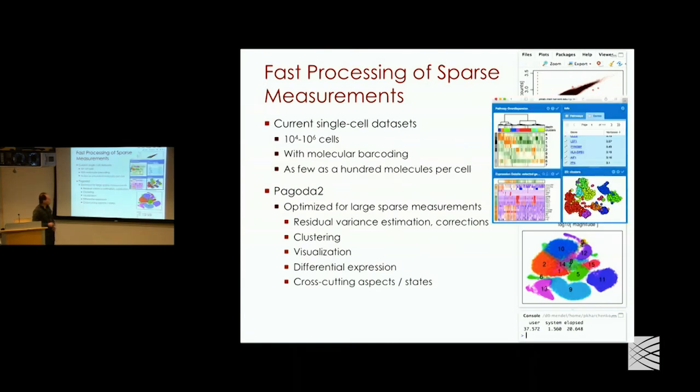So yeah, the UI. This thing we just put up there, but it's really an alpha version, to be honest. We're building a new UI that will be scalable. But right now, we also have the use of the old UI. Turns out the UI actually scales to 10,000, 20,000 cells reasonably well, unlike the rest of the backend. So you could try to check it out, but probably in a month it's going to be a lot better. We're going to have tutorials up and so on.